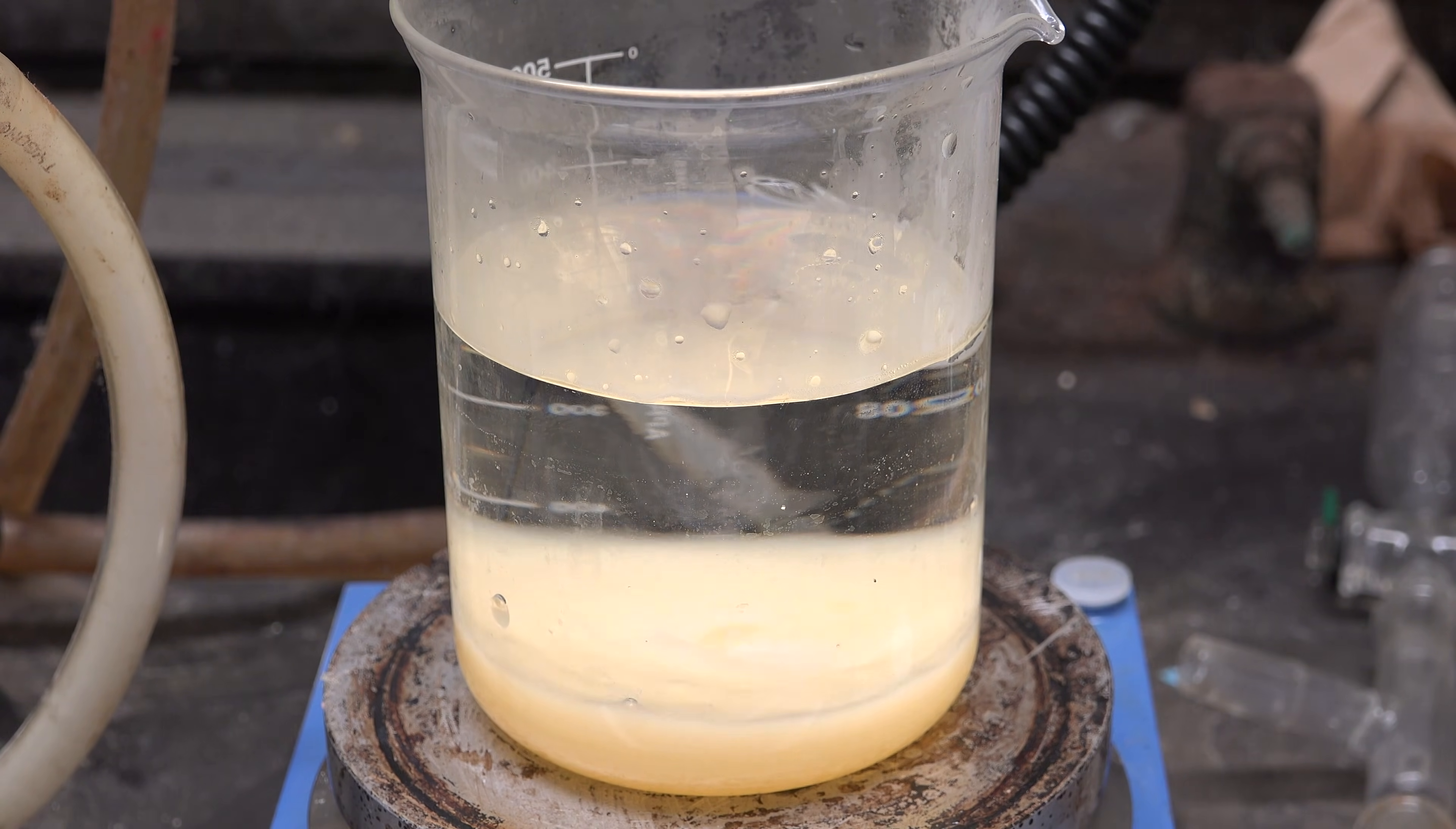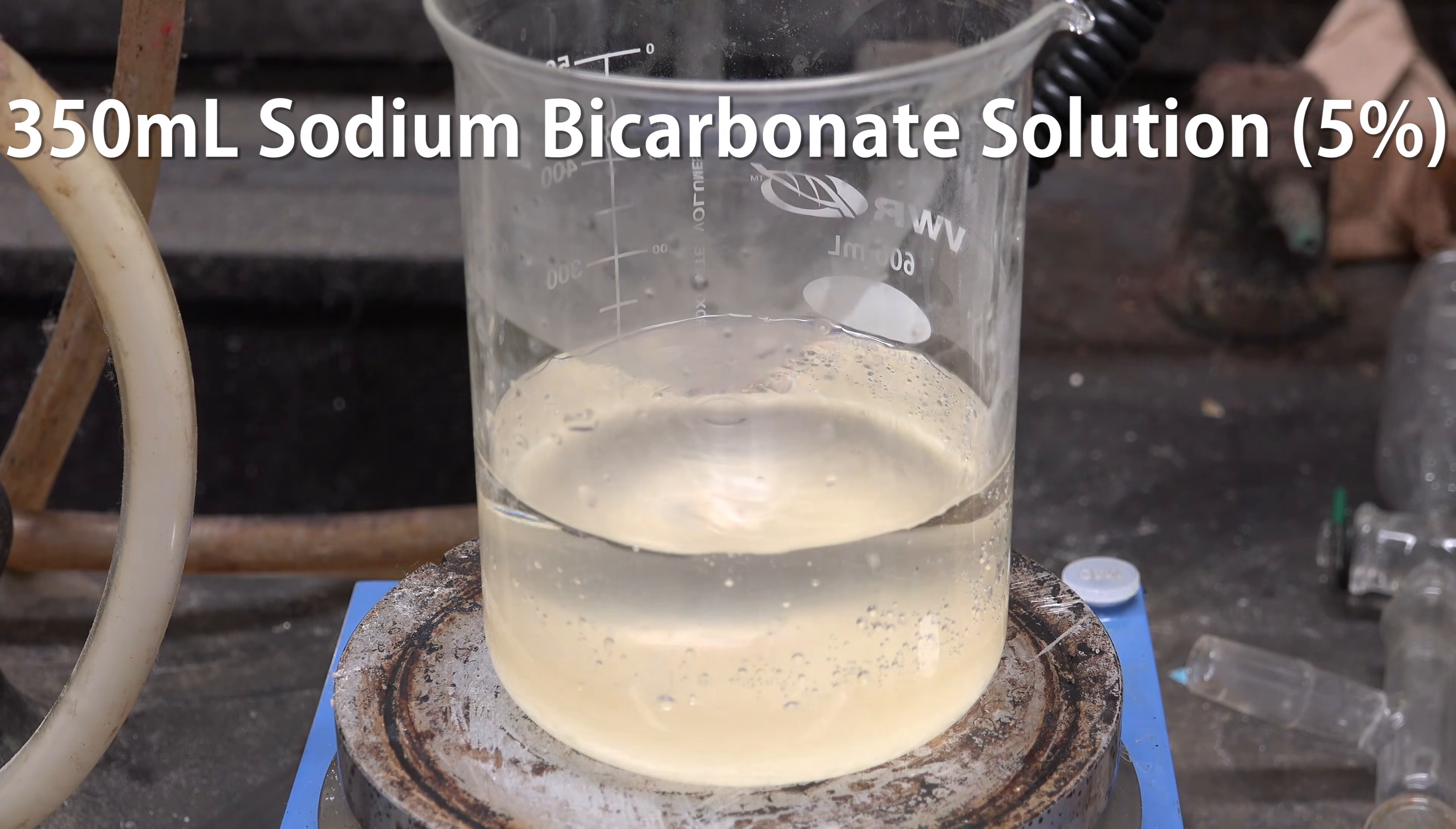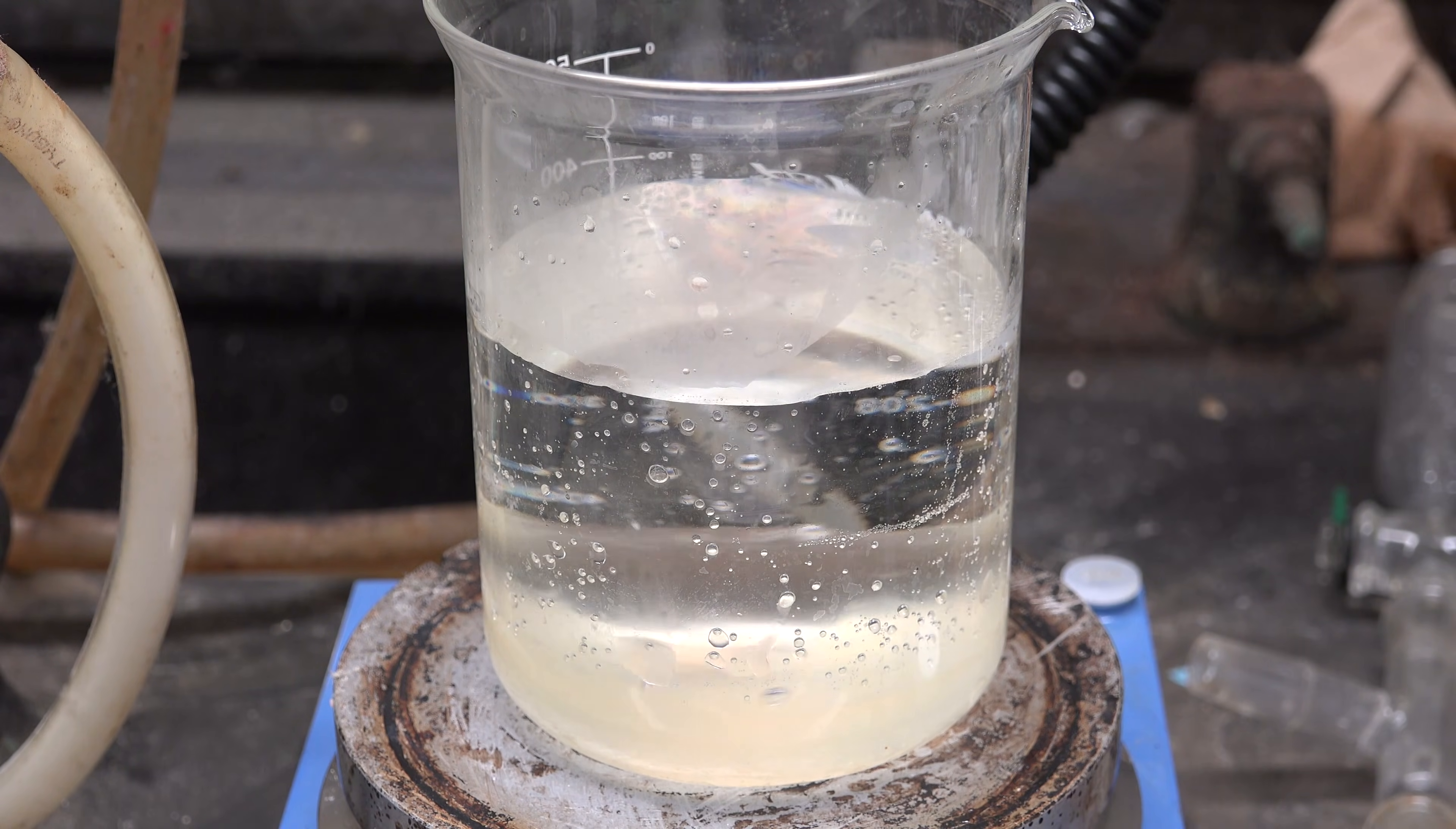Stir the mixture for 10 minutes to absorb any dissolved hydrogen bromide and ethanol that may have distilled over. Now decant off the supernatant. Add in a 5% solution of sodium bicarbonate, basically 5g of sodium bicarbonate and 95g of water. I'm using 350 mL worth. Stir the solution for 10 minutes or so until it clears.